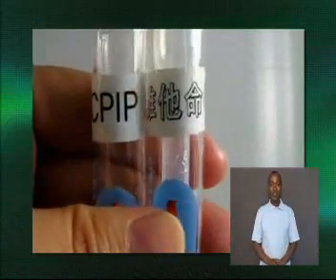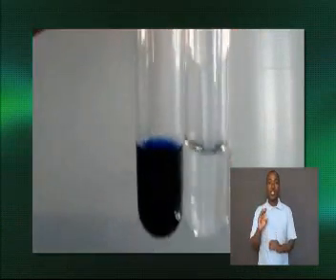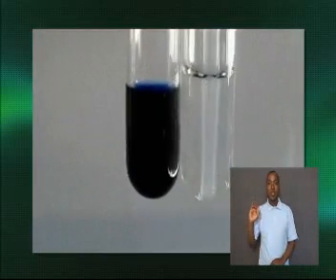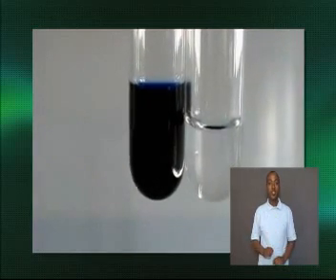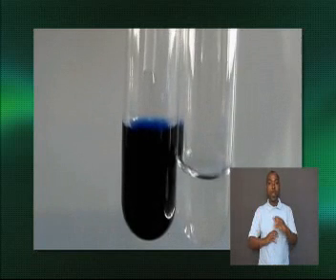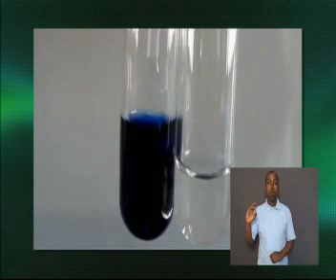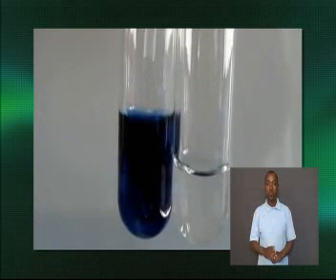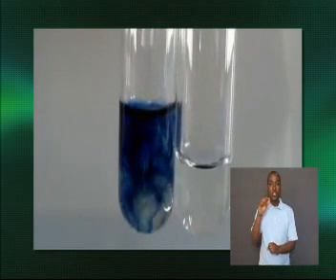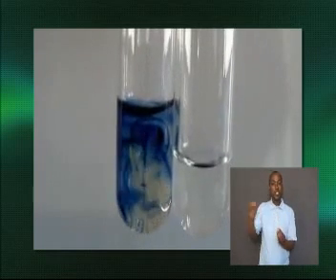There is a simple way to determine if a substance contains vitamin C using a DCPIP reagent. DCPIP is a blue chemical compound called dichlorophenolindophenol. To carry out this test, a small amount of DCPIP reagent is added to a clean test tube.